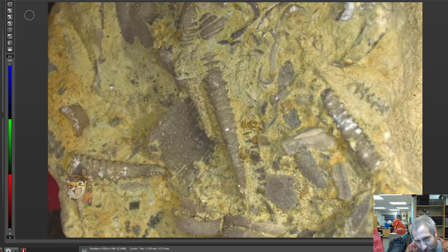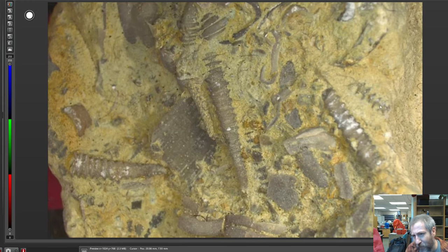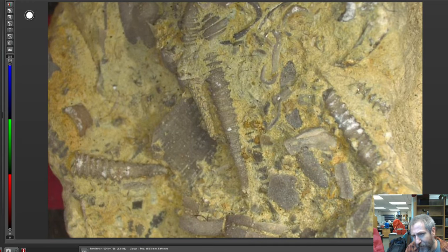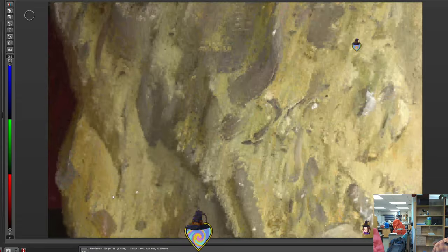It's got a couple of possible options. It could be a straight-shelled nautilus. It could be a type of coral. It actually looks coralline to me, but it doesn't look like any of the corals I've ever seen. And then this over here actually looks like an Archimedes coil right there, like you're just seeing a transect of it. So it's possible that it could be a view of one of the Archimedes coils without some of the fans on it. Always possible.